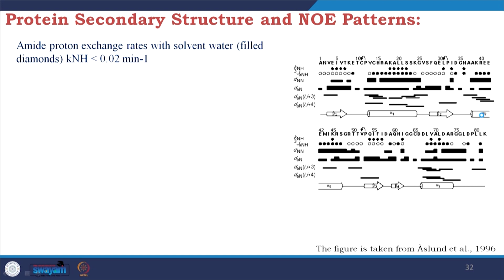So, if you look at the secondary structure assignment of this protein, there is the amide proton exchange rate with solvent water, which is filled with the diamonds here, these ones.